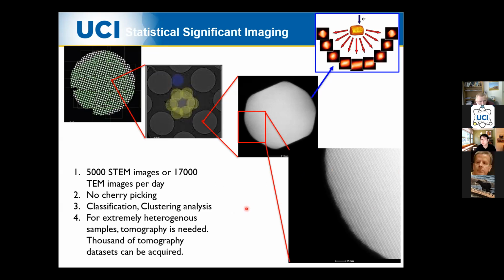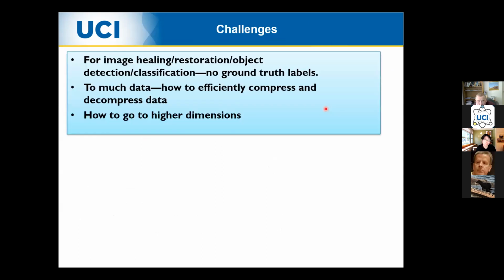It would take almost forever, not some task that can be done in a reasonable amount of time, right? And of course, in cases where you really need the three-dimensional shape of the material, you need to do electron tomography and all that. So this is basically a multi-scale problem that we're facing in the TEM, right?